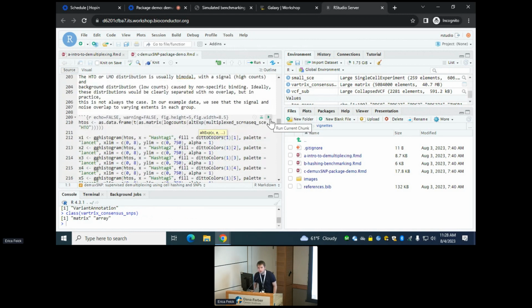Did you make that, or is that publicly available? The SNPs? Yeah, the SNPs. There are lists of common variants. If you're interested, come up and chat to me at the end, and I can point you to those. Here, this is a subset of about 2,500. If you look at 1,000 genomes common variants with frequency over, I think it's 5%, it's actually about 7 million SNPs. So to actually get the package onto Bioconductor, we've had to subset this. But one of the functions in the package actually subsets it for you, and I'll go through that in just a minute.